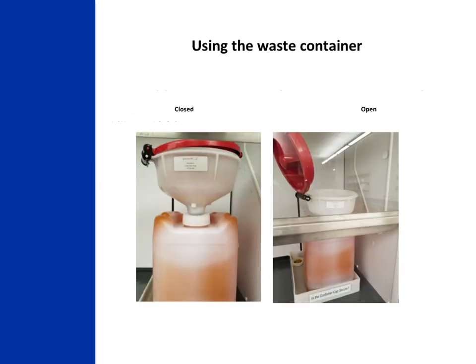When pouring waste in the waste containers in the hood, please double check before you pour your waste into the waste container that the funnel is open or in the up position, as shown in the picture on the right, and not closed, as shown in the picture on the left. When multiple students pour waste in a closed lid of the funnel, it becomes not only a safety hazard for others in the lab, but also a serious safety hazard which has resulted in injury of our personnel who prepare your labs.